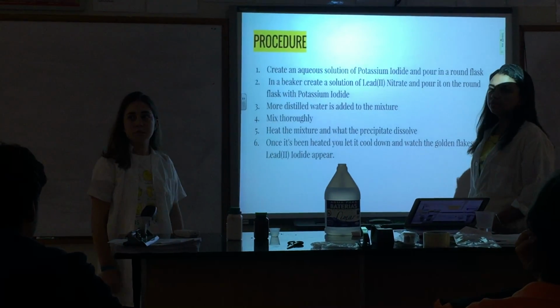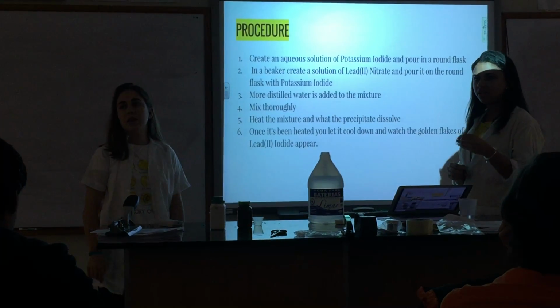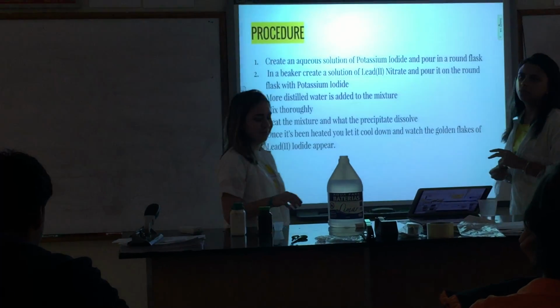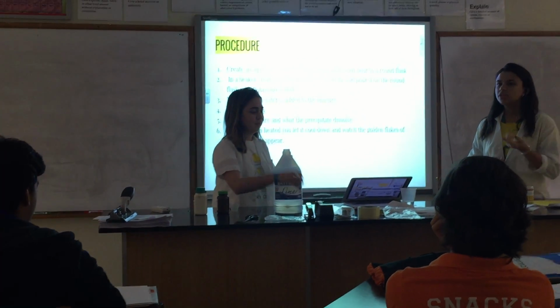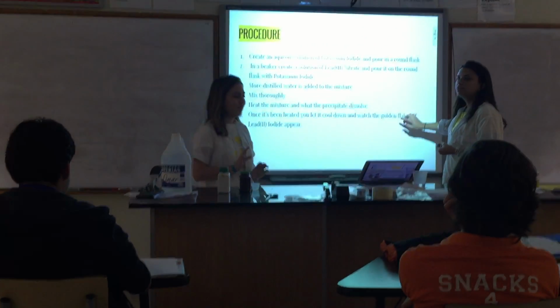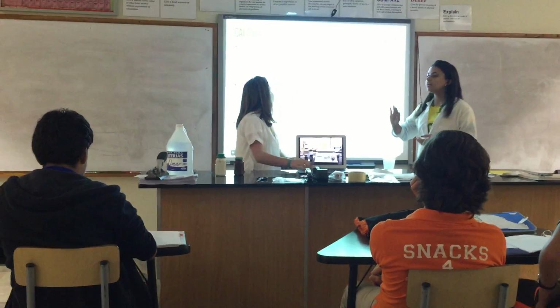Do you want gloves to wear? No, because right now we're not going to be picking it up yet. But it's not going to be splashing out or anything like that? No, it doesn't splash. They know their stuff, Mr. Costa. No, I know, but I'm just saying, if you get lead on your hands, it actually soaks in. Okay.